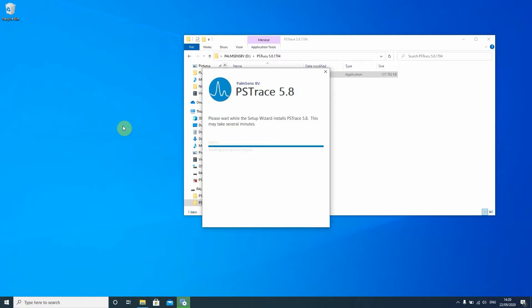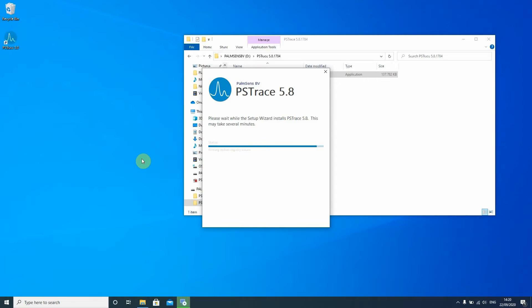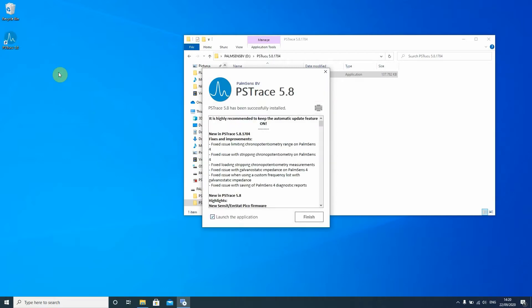Once that is done PS Trace will automatically add an icon to your desktop so you can very conveniently open it. You will also get a short list of the history of the PS Trace updates. This is especially useful if you have used a previous version of PS Trace and you would like to know what new features were added for this version that you're now installing.